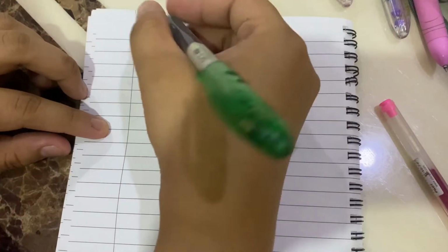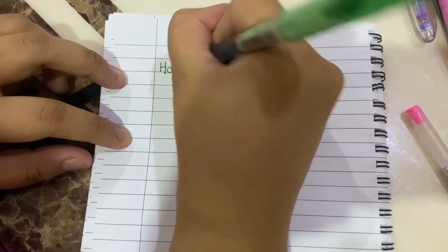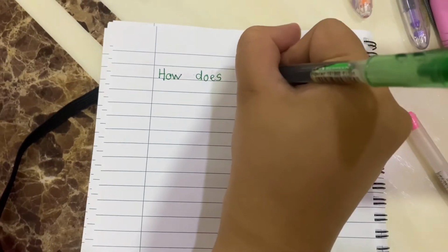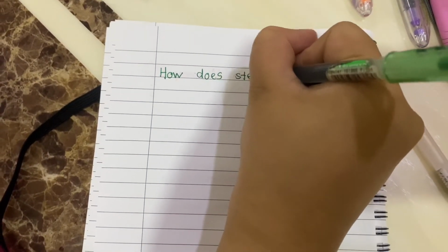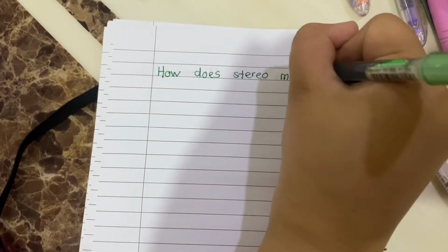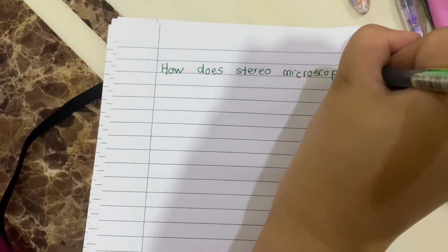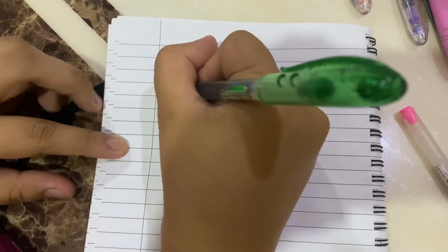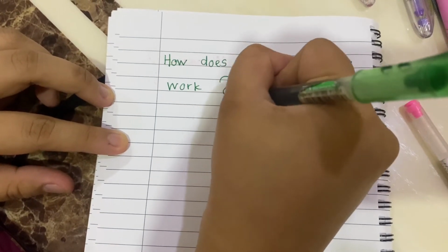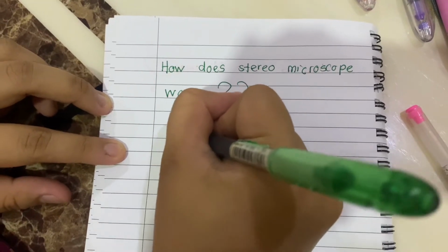So, how does a stereo microscope work? A stereo microscope uses reflected light from the object. It magnifies at a lower power, hence it is ideal for magnifying opaque objects. Since it uses light that naturally reflects from the specimen, it is helpful for examining solid or thick samples. The magnification of a stereo microscope ranges between 20x and 50x.